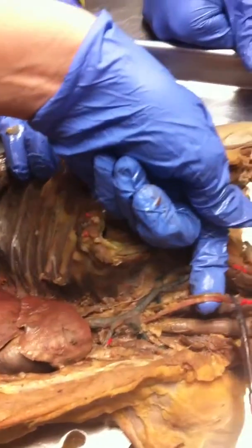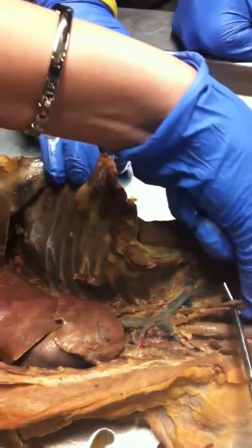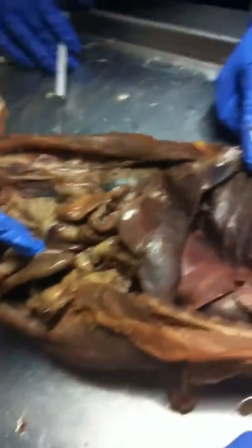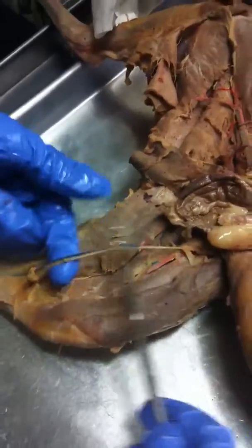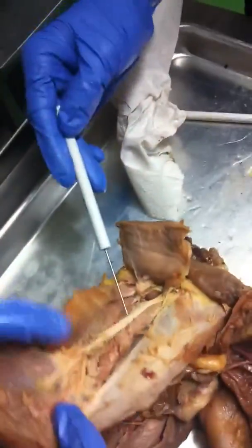The vagus nerve? I'm not sure if it's the vagus nerve or if it's a vein, because it looks kind of bluish to me. It does. But it might be the vagus nerve. Femoral nerve? Yeah. All right, femoral nerve would be right here. And the sciatic nerve would be that big, thick guy right there.